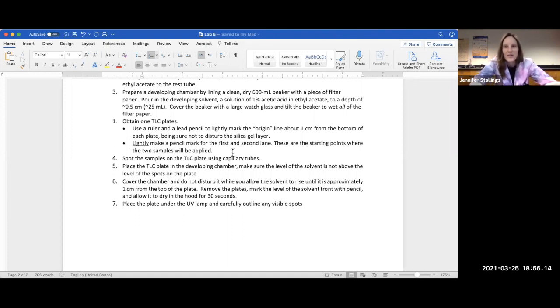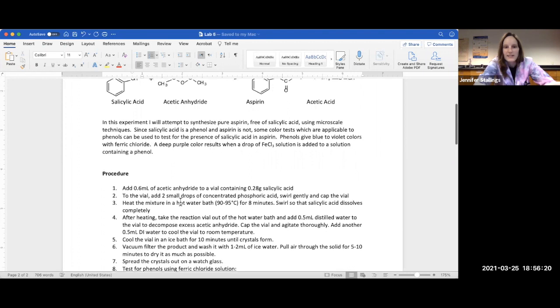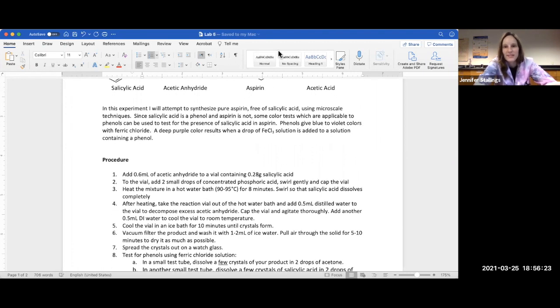So let's get started. I'll go put on my PPE and I'm going to begin by synthesizing my aspirin here. All right.